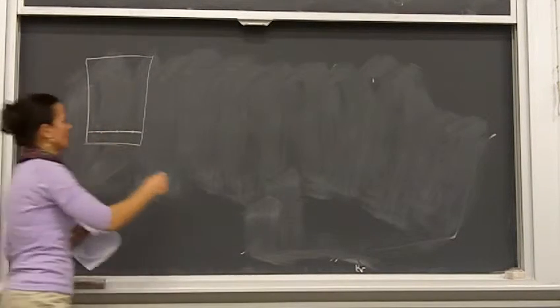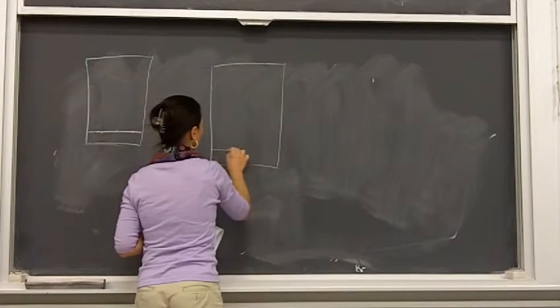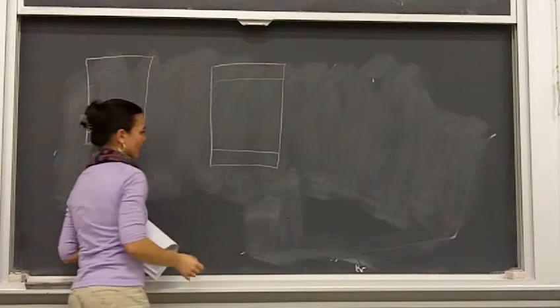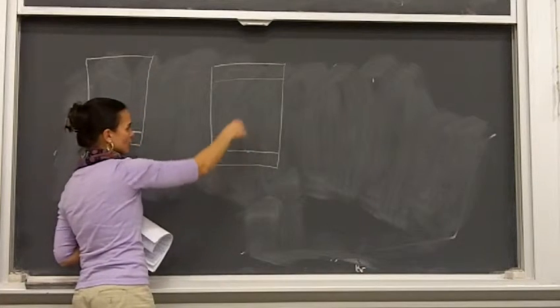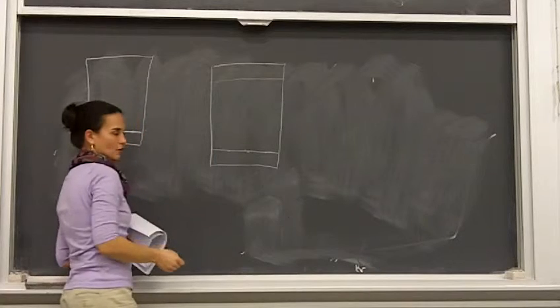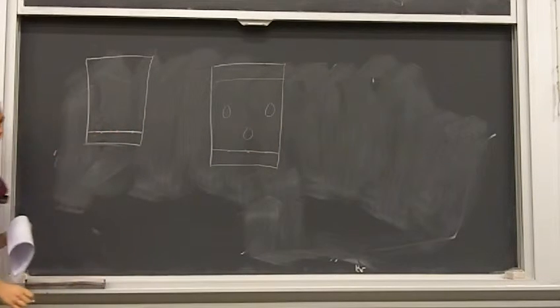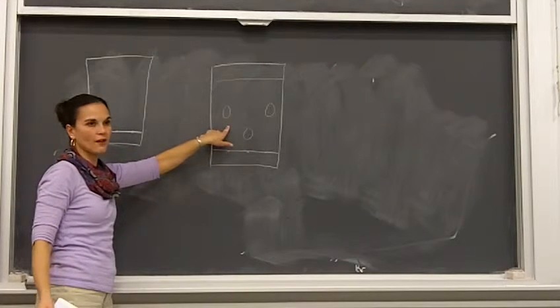So this is our example of a TLC plate that has been prepared to be developed. And then after you get the TLC plate out, you still have the line that's on the bottom in pencil. In pencil, not pen, you will draw where that solvent line is. We still have where we spotted on the bottom, but now what should have happened is those spots have traveled up the silica in a certain way. So say we've got a spot here, and a spot here, and maybe another spot here, okay? So under the UV light, now you will see these spots and you will draw them in pencil.